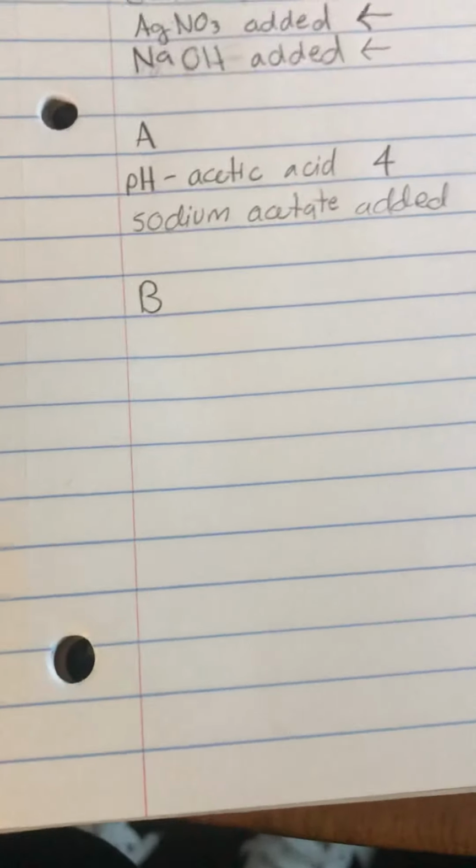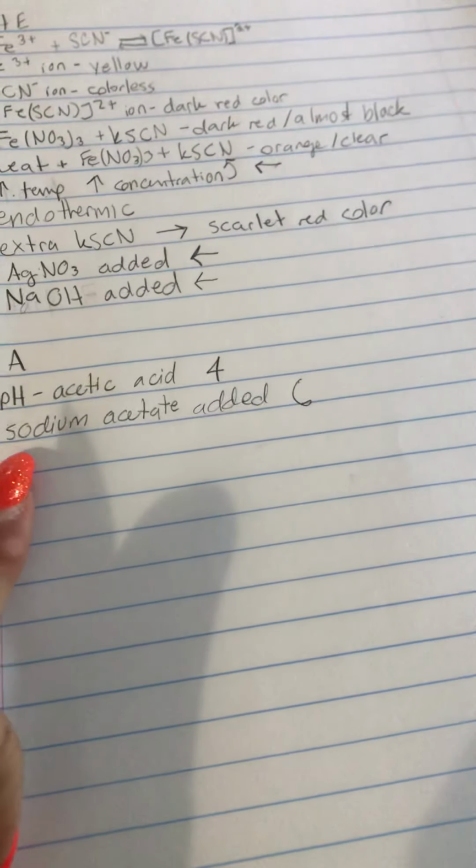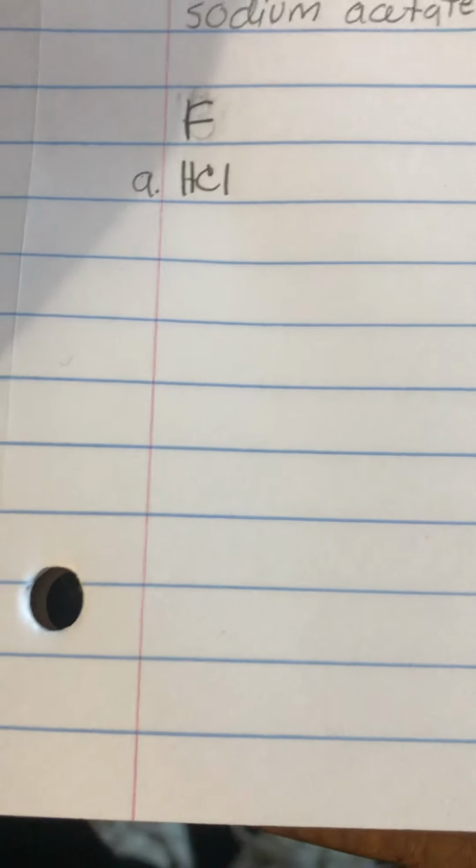Okay, the next reaction we're going to analyze is F. And the questions in F start with, what product was removed by aspiration? Well, the product that had to be removed during aspiration was the acid, because when it was removed, the solution became more basic. And then it says, explain the indicator color change.